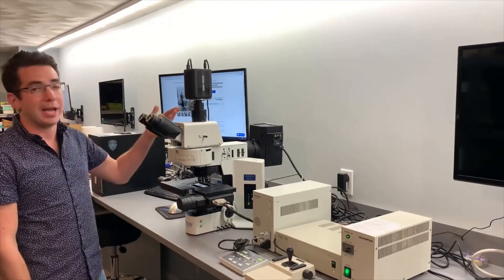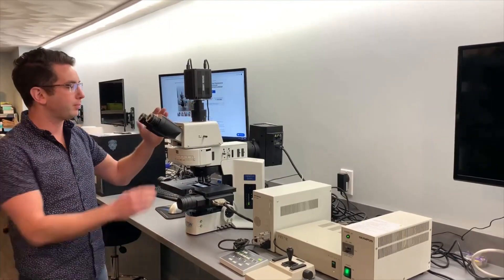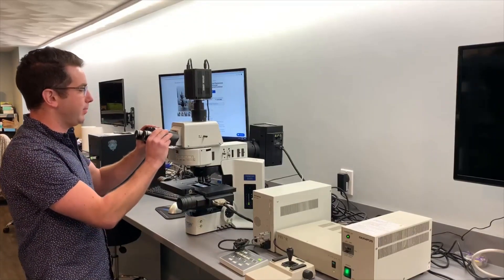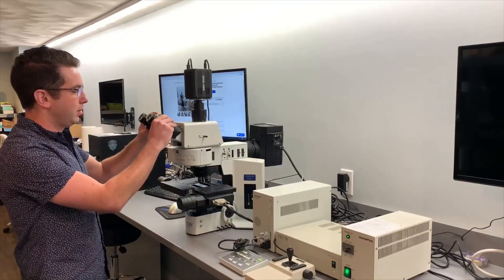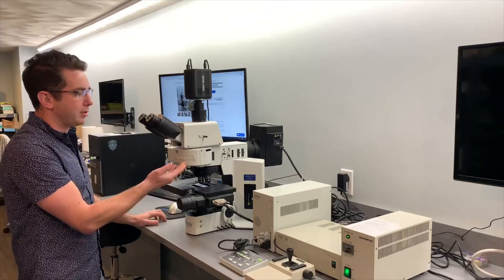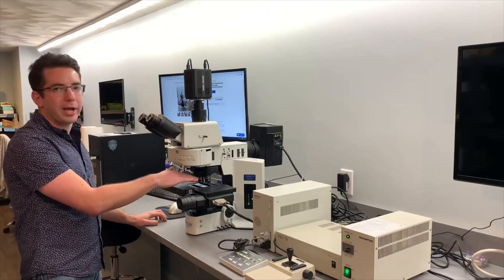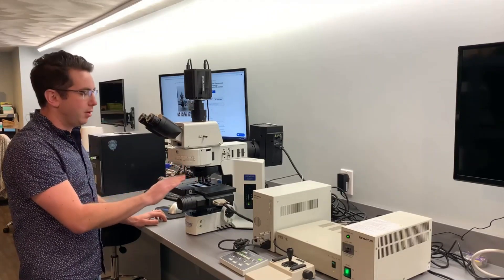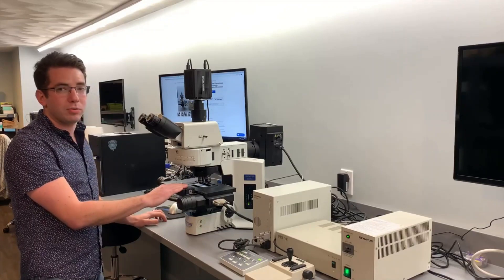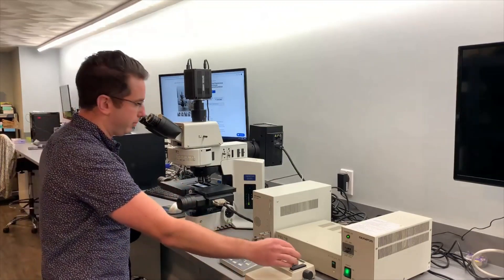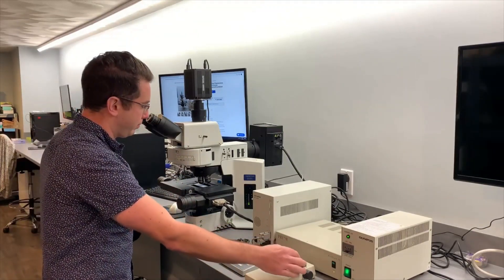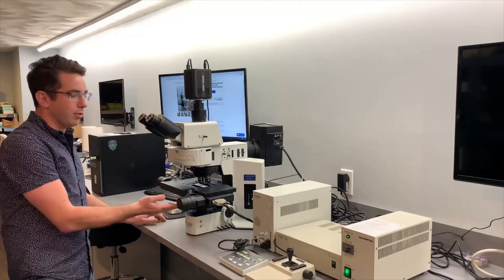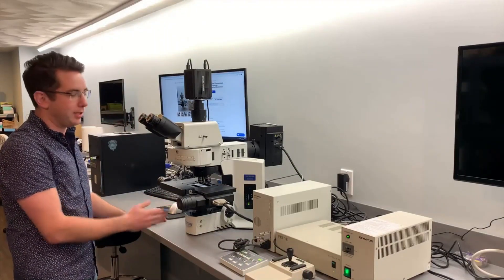It's camera ready with a trinocular port, convenient and easy to use ergonomic head, six place motorized filter turret, motorized sextuple nose piece, motorized prior ProScan 2 stage with controller and a universal motorized eight place condenser.